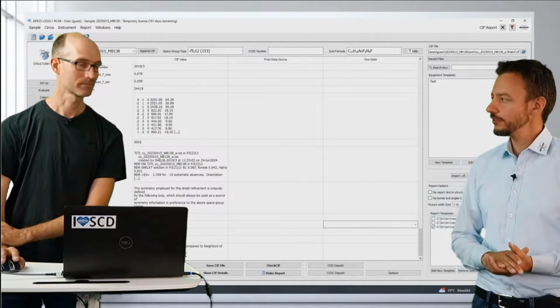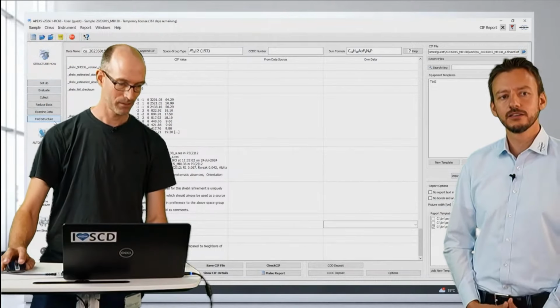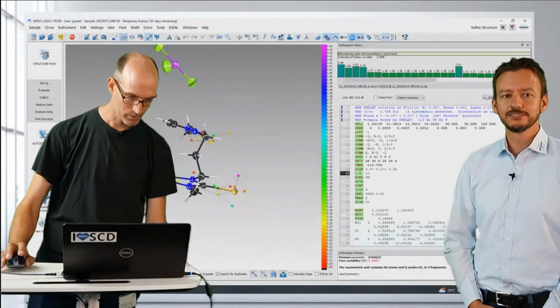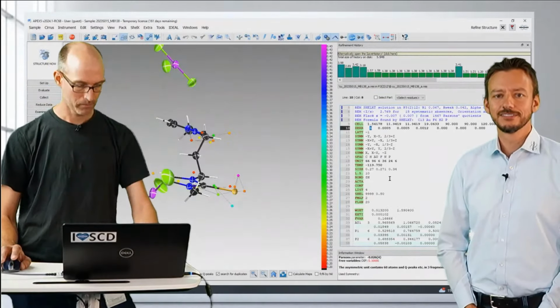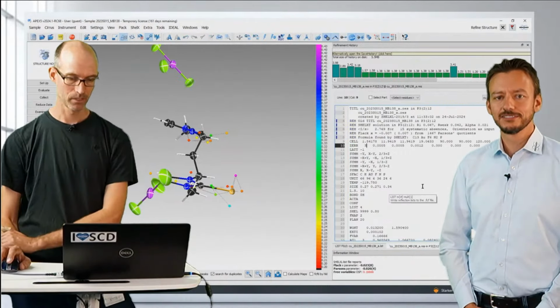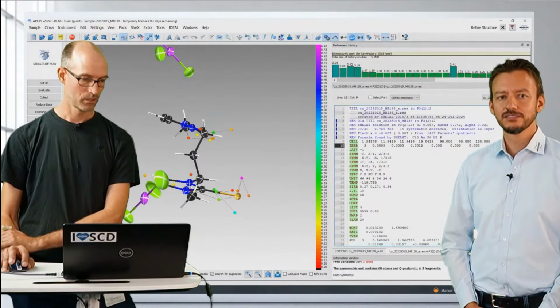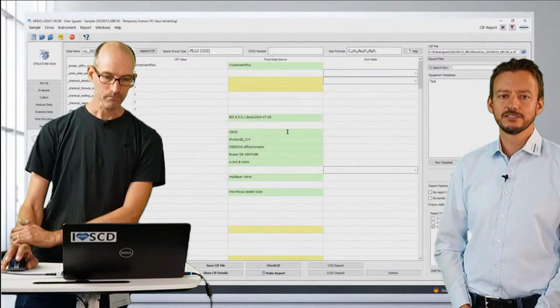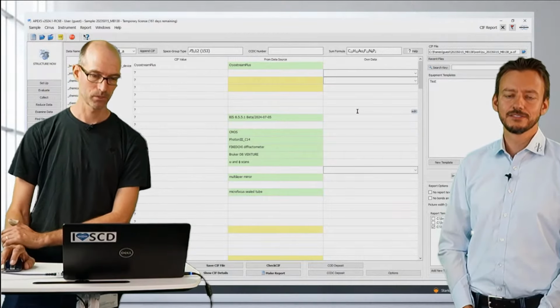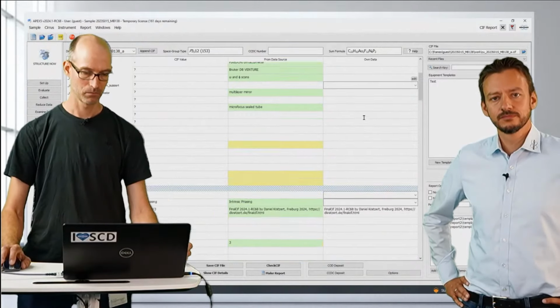So if you go back to refinement and change it, could you quickly do that from 6 to 3? Yes, that's the nice thing, that if you do changes in your structure and do not solve, refine, if you want to make smaller changes and do another refinement, and you go back to FinalCif, all the information that you previously put in is restored, and only the updated information is updated.